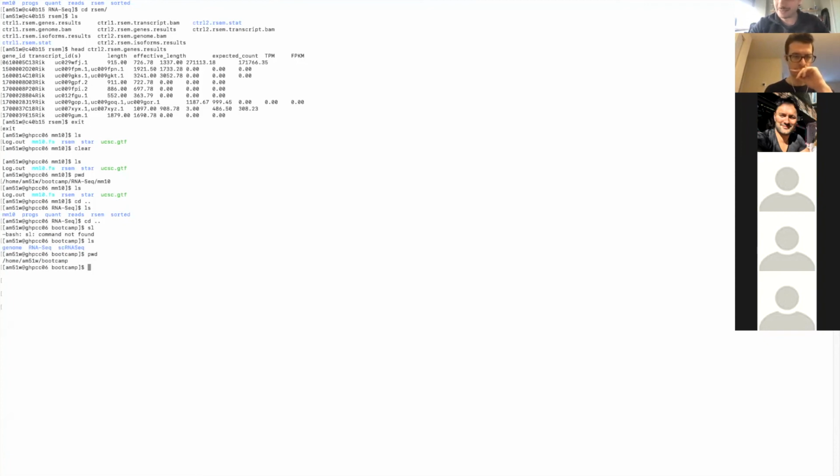There are other places where you have more space to do more quantification and alignment, especially when your sizes are much higher than the simple examples you have over here. For the last 2 sessions, when we cover single cell analysis, we will deal with much larger FASTQ files and how to align them. Alper will also show you how to use Dolphin Next on either Tuesday or Thursday next week. We're going to cover that as well while doing single cell analysis, and we need a little bit more space.